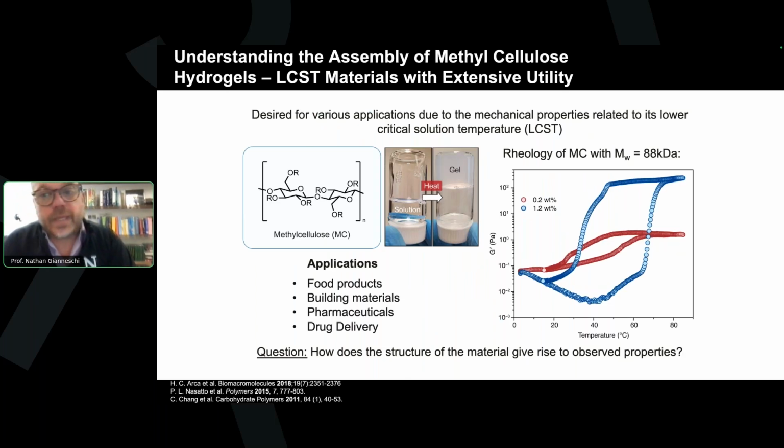We got into this thinking somewhat agnostically initially about the types of gels we would look at. My student and co-author on this, a manuscript that's out for review currently, looked at a whole lot of different candidates. One of the features of the liquid cell, and I'll show a movie in a second, of course, many of you know this already, is that we can load free-flowing liquid samples quite easily. And that meant these lower critical solution temperature hydrogel materials became excellent candidates.